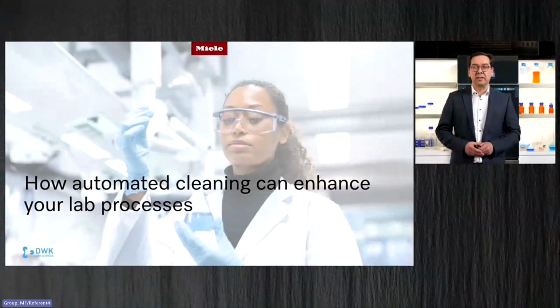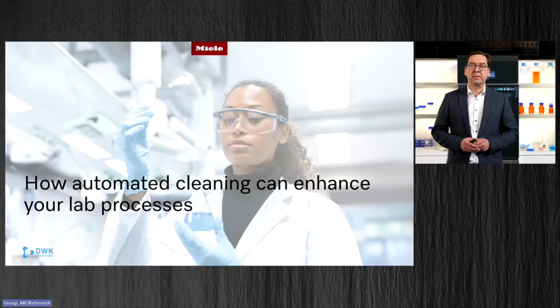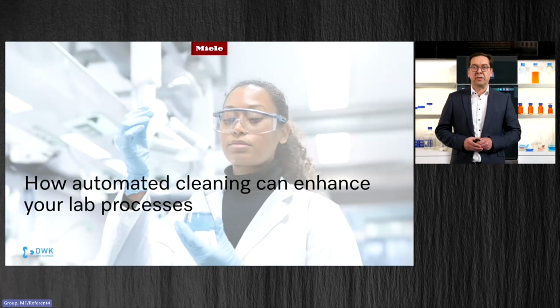Valuable information about your high quality glassware. Very much appreciated. Dear guests, in the second chapter of our webinar, we want to talk about the processing of laboratory equipment now. We want to make you familiar with the basic principles of laboratory glassware cleaning, and we want to explain to you which factors have a positive or negative influence on a good cleaning result.